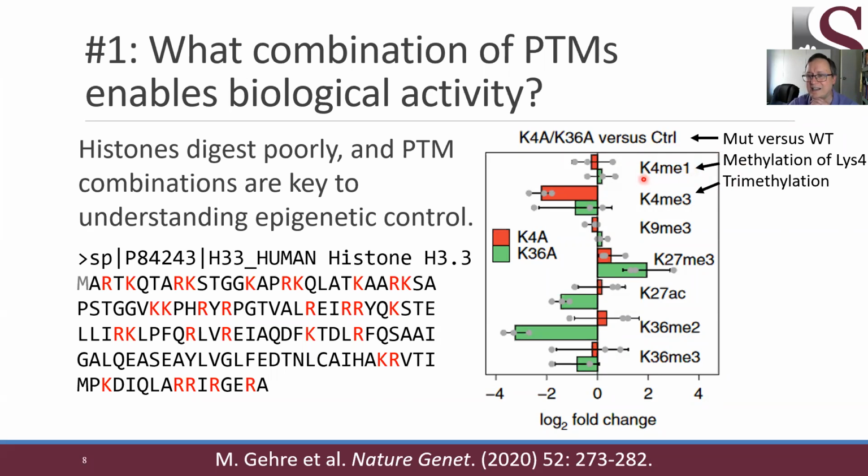Here we're looking at lysine at position 4 in the sequence, this one right here, in other words, and we're asking about a single methylated form of that. What we're noting here is that the lysine is not just a trypsin cutting site, it is also a location where it's possible for a methylation to take place. In fact, that's not the only possible modification at lysine 4. Lysine 4 might be singly methylated, or it might be trimethylated.